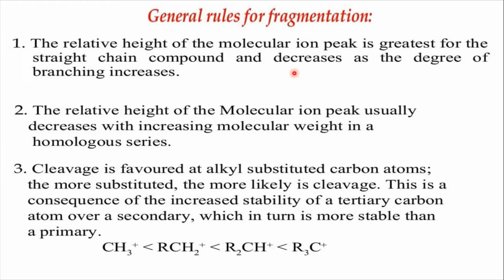As we know, fragmentation is nothing but the cleavage of bonds. So, in the fragmentation process, there is cleavage of a carbon-carbon single bond, carbon-hydrogen bond, or carbon-nitrogen bond. If you observe, compounds of the same class have a unique fragmentation pattern used as a fingerprint for qualitative identification. Suppose we consider a straight chain alkane and a branched chain alkane. In the branched compound, the cleavage occurs at the branching point, and due to this there is a formation of a stable carbocation.